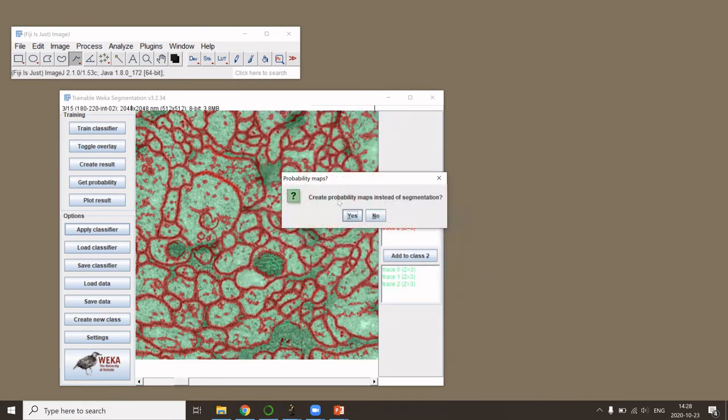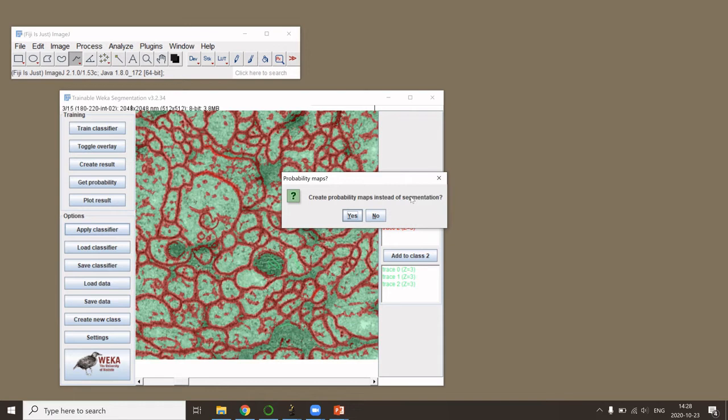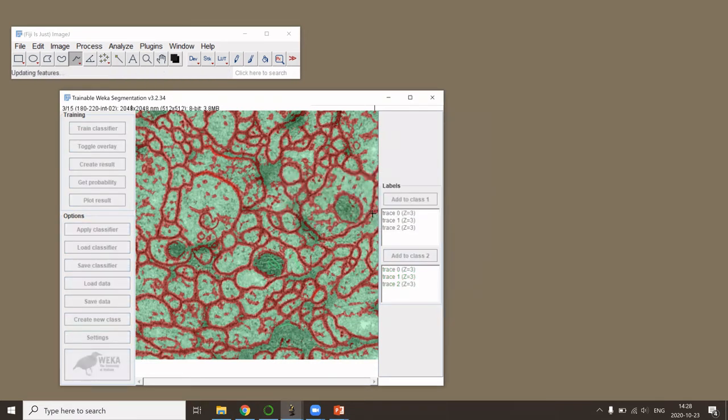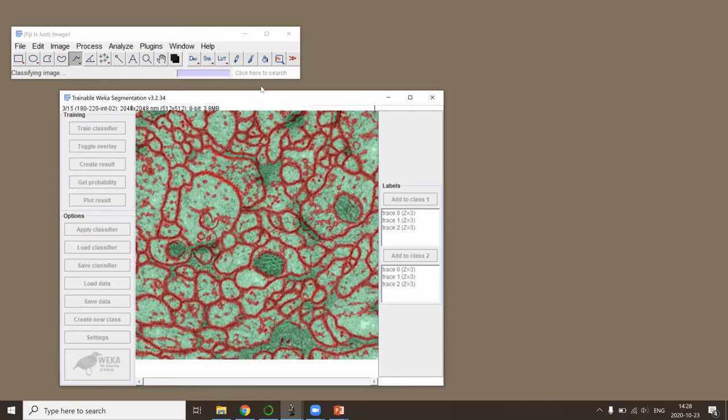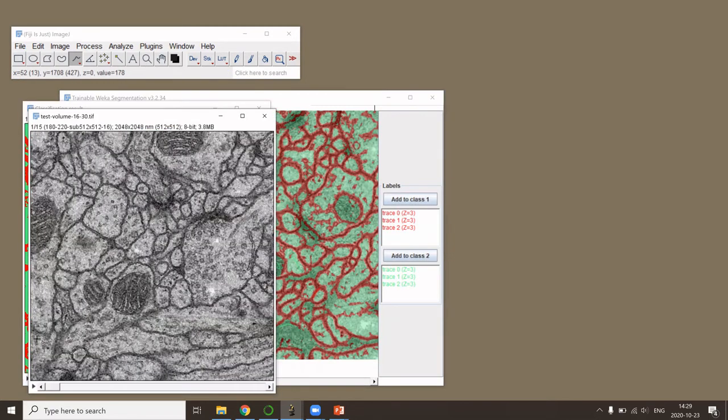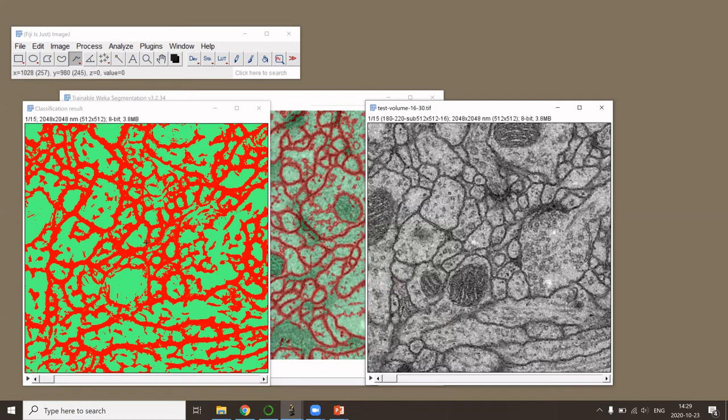You can either create a probability map or segmentation. Probability map obviously tells you how sure it is that a pixel belongs to a certain class, and segmentation is really a labeled mask. In this case, I would prefer segmentation, so I click no. Now it is applying the classifier that we had trained on the active open image that I had in Fiji, on the image stack that I loaded now with apply classifier. So now what we got is the output of the classification on the new stack.